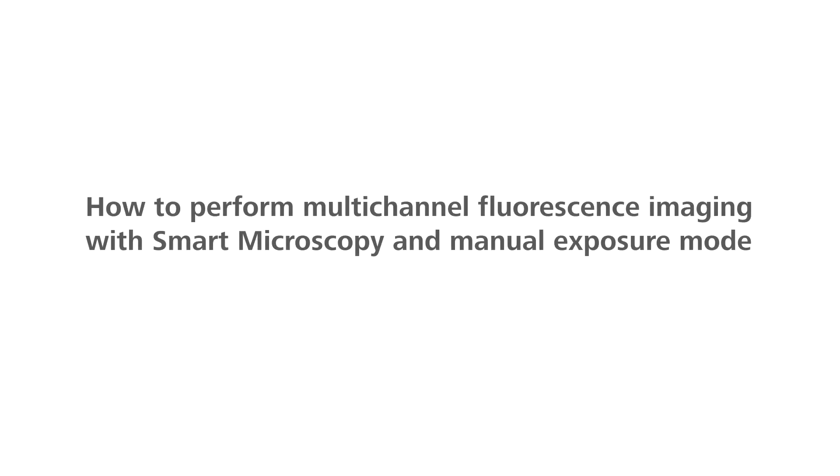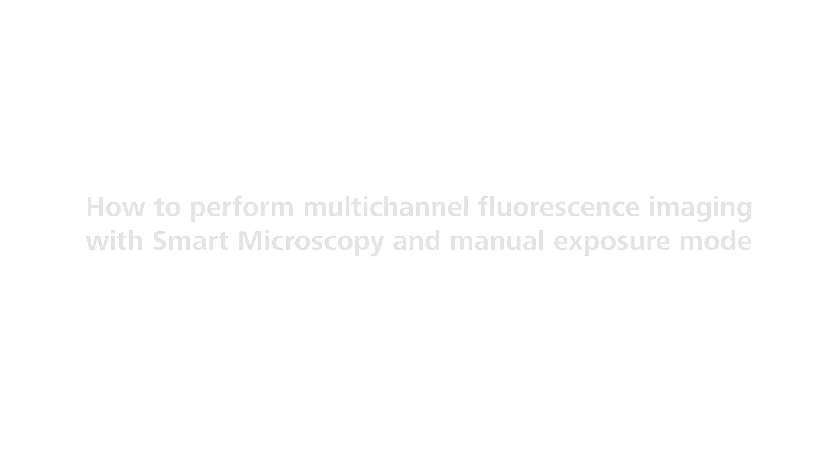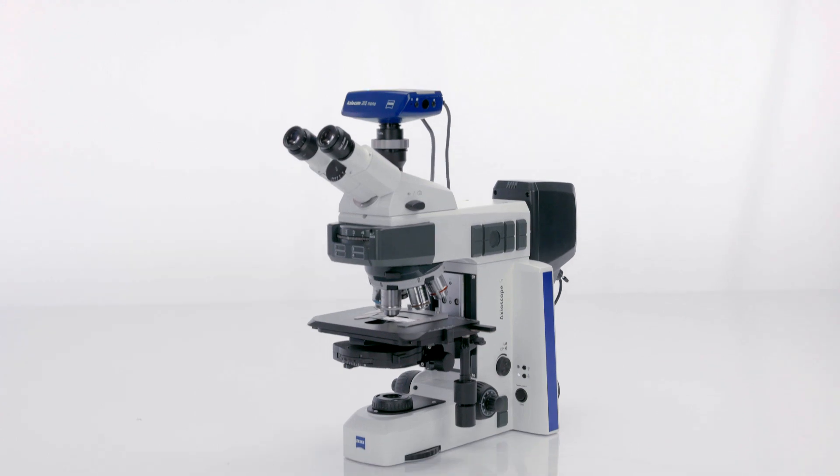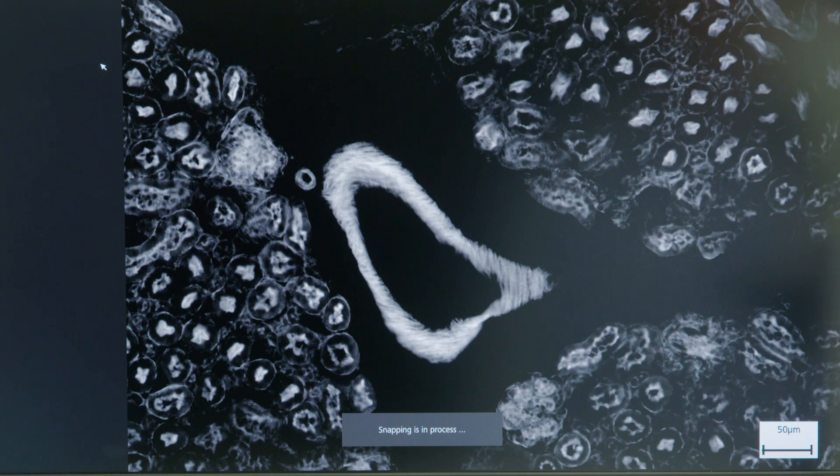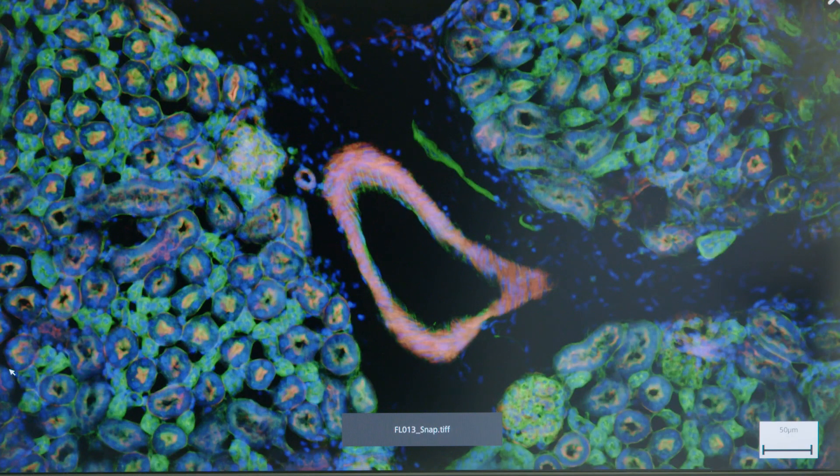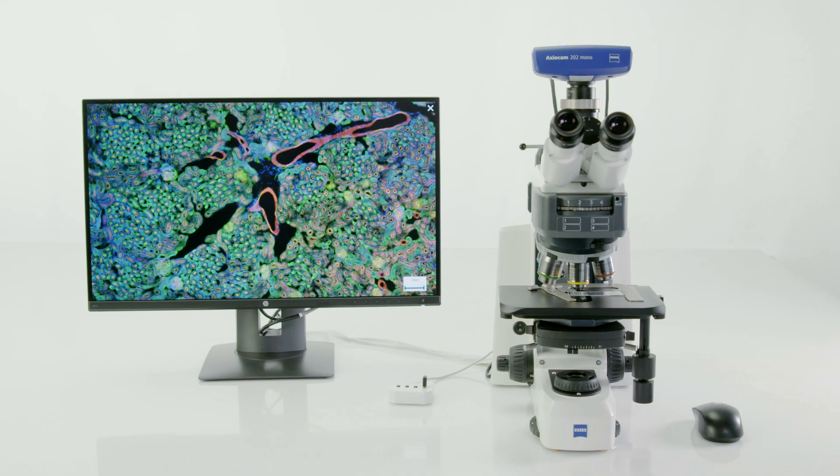How to perform multi-channel fluorescence imaging with smart microscopy and manual exposure mode. Imagine being able to acquire overlaid multi-channel fluorescent images complete with the right scaling using just your microscope, even without a PC.